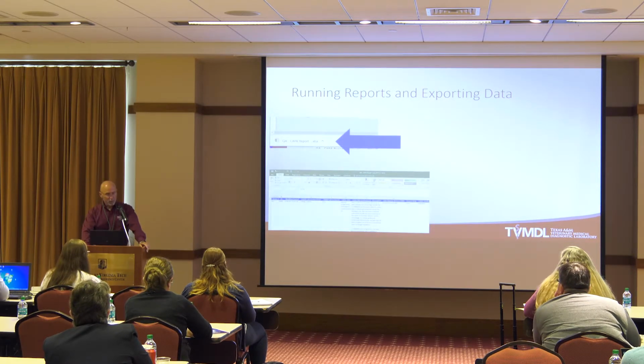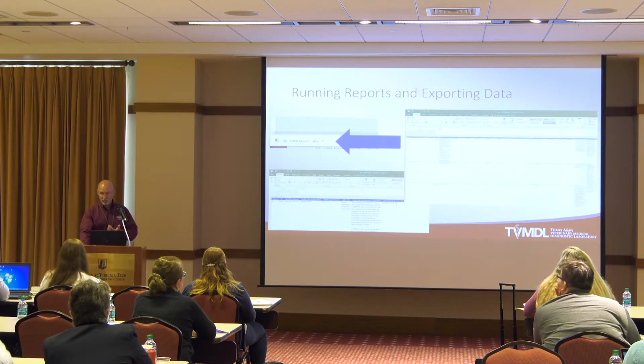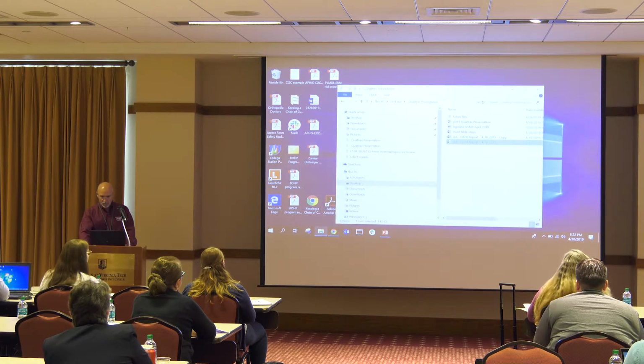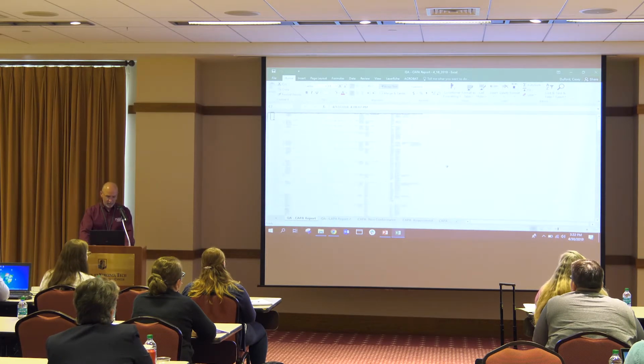Once I select that to open it, this is what it looks like. And I'm going to actually open a report here in a moment, but I want to show you what we're going to see. So it looks something like this. And if I zoom into a little more data, it's just a big, huge table from that particular workflow. All right, so let me escape out of there. All right, so this is that report, and once you click on that, this is what it looks like. So if I zoom way out, this is our data.